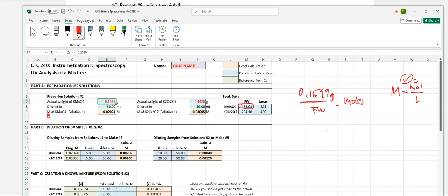Next up is the liter number. In order to do liter, I'm going to take milliliters, and milli means 1,000, so I'm going to divide this by 1,000 in order to get liter. Again, something that we've done over and over and over. All of the volumes and the prefix conversions, that's what this is all about. So we took 50 milliliters, and 50 milliliters divided by 1,000 will give me the liter amount. And guess what? Ta-da! I've got that liter.